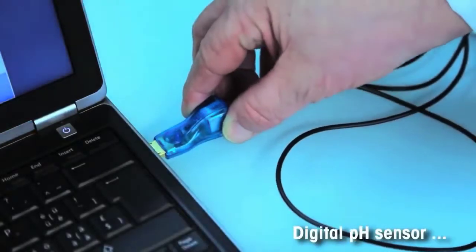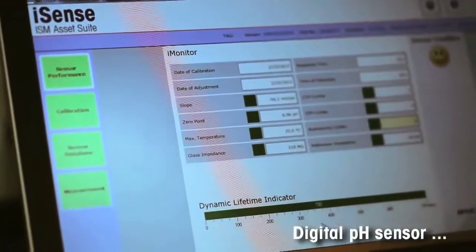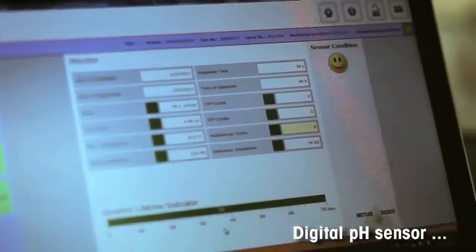Simply connect the digital sensor to your computer and iSense Asset Suite software immediately informs you about the sensor's status.